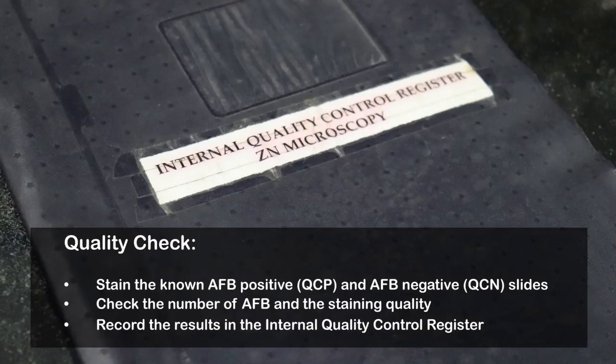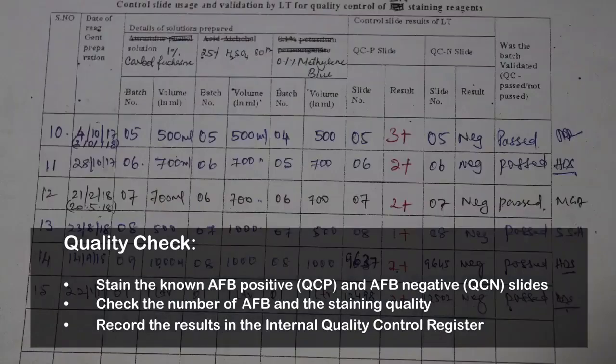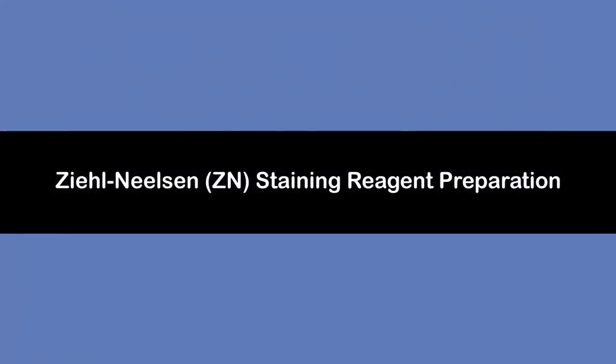Quality check is performed by staining known AFB positive and AFB negative specimen slides. Check the number of AFB and staining quality, and record the results in the log book. This concludes the training video on Ziehl-Neelsen staining reagent preparation.